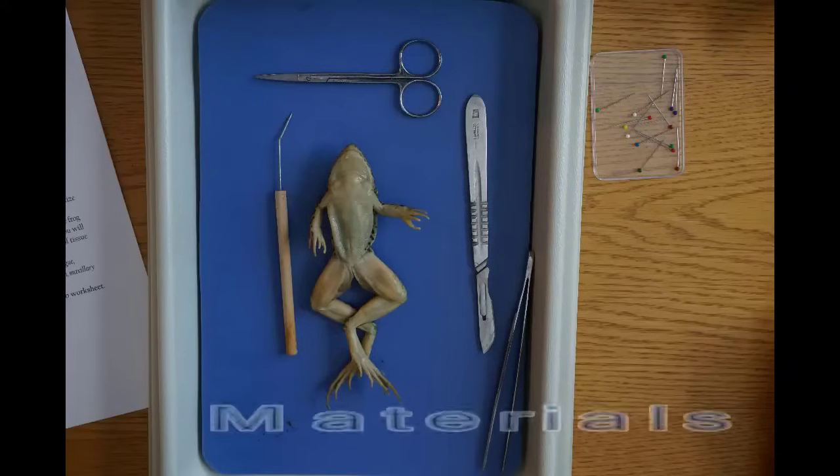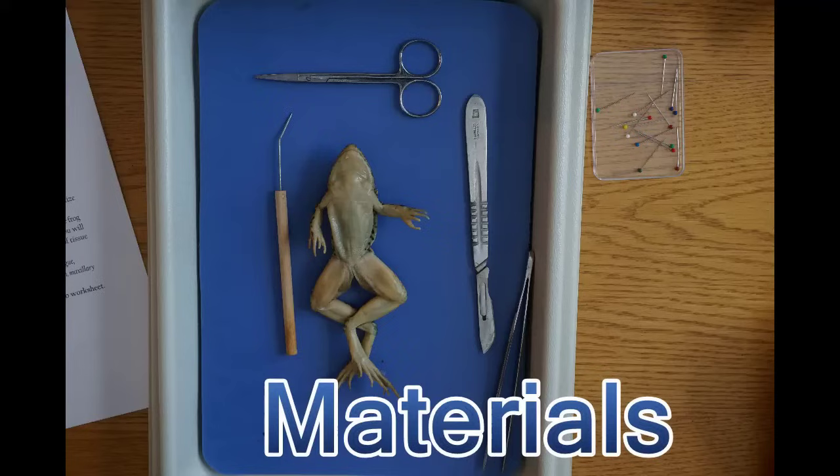Welcome to the frog dissection. Today you'll need your standard dissection tools as well as a tray and a frog.